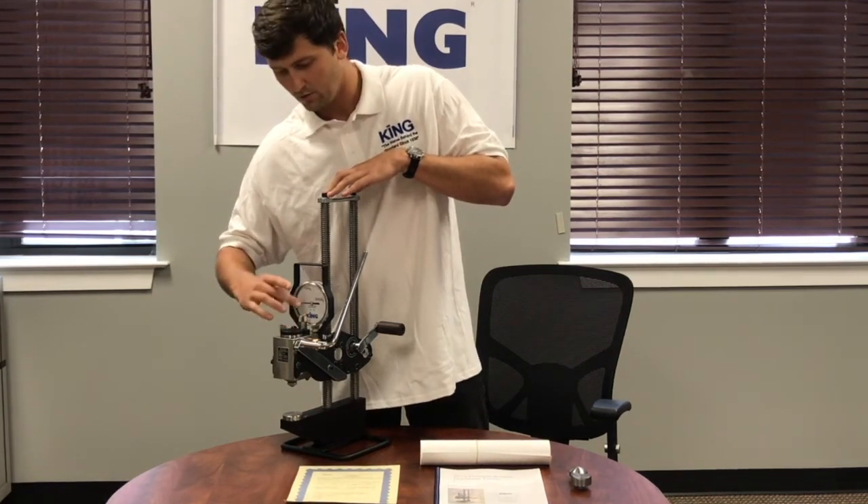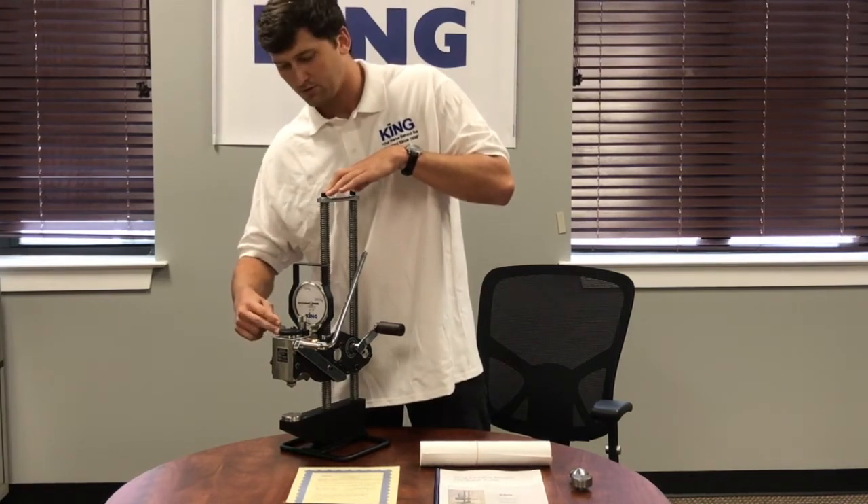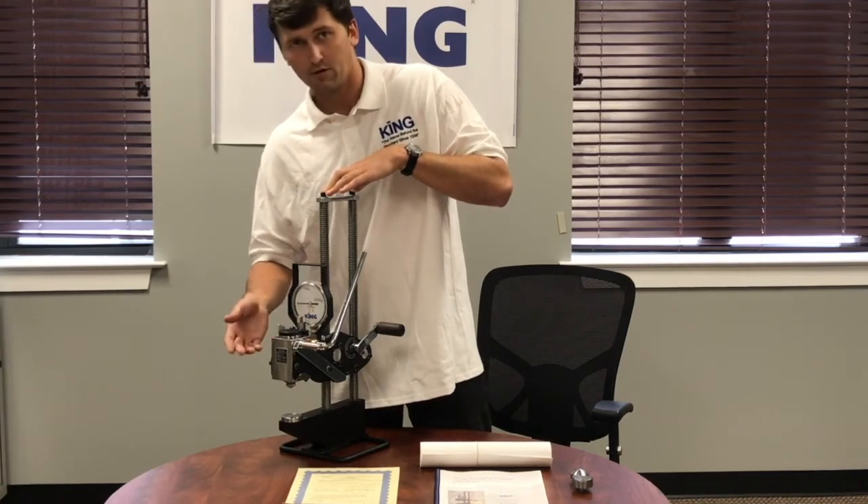The calibration assembly used to be internal — we have moved it to external. We also have our pressure release valve and engage valve here, which will be set when you go to run a test.